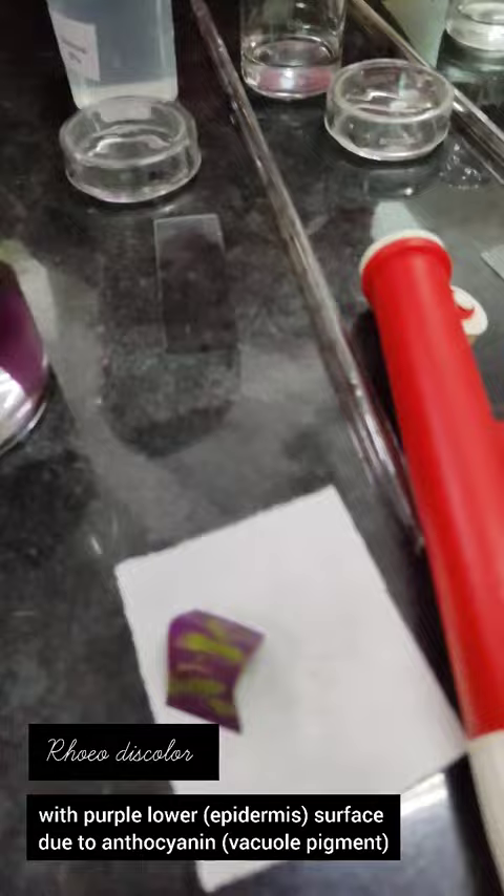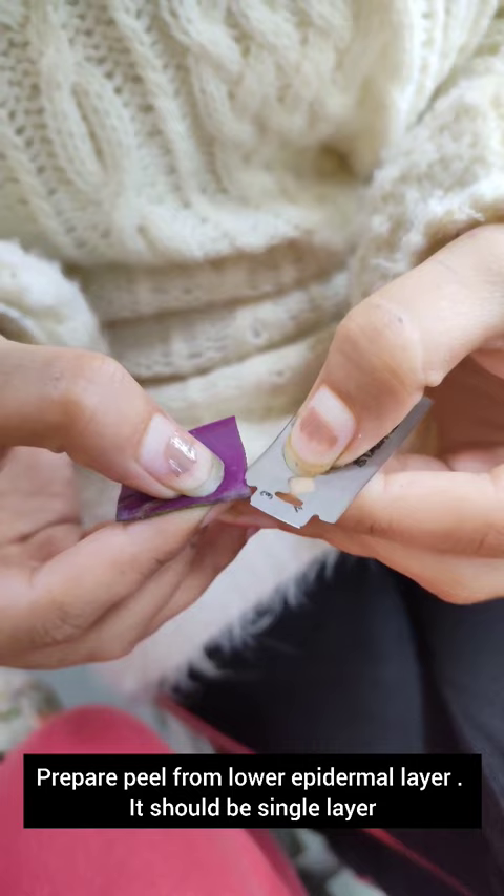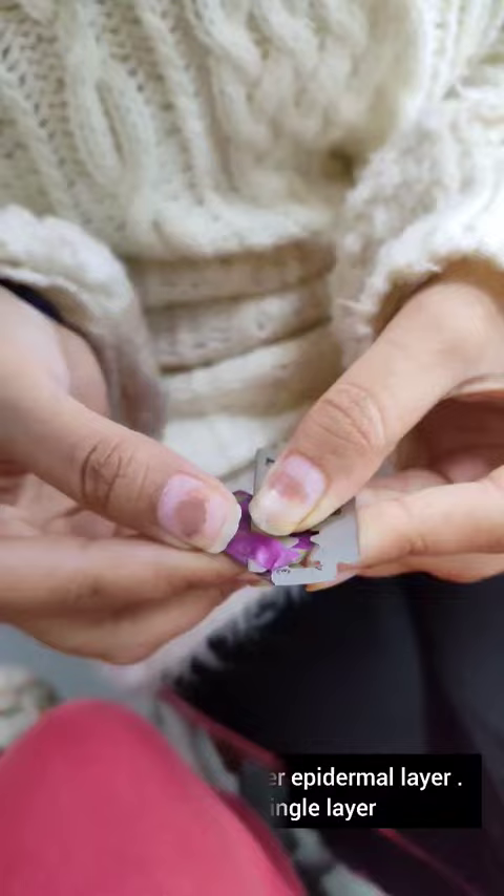Now we will prepare a peel from the lower epidermal layer — it should be a single layer. As you can see, with the help of a blade I peel out the lower epidermal layer.